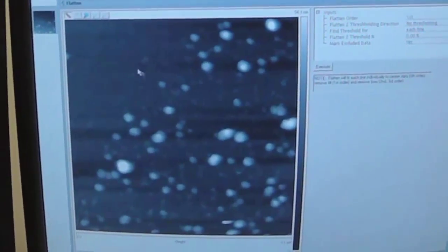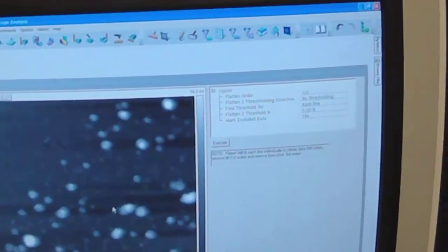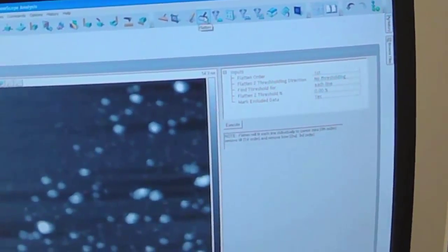First, let's flatten to make sure that the background is flat. We can do that in a couple of ways. Here's the flatten routine. And here it says, let's do a first-order with no threshold. If I click Execute, it did it.